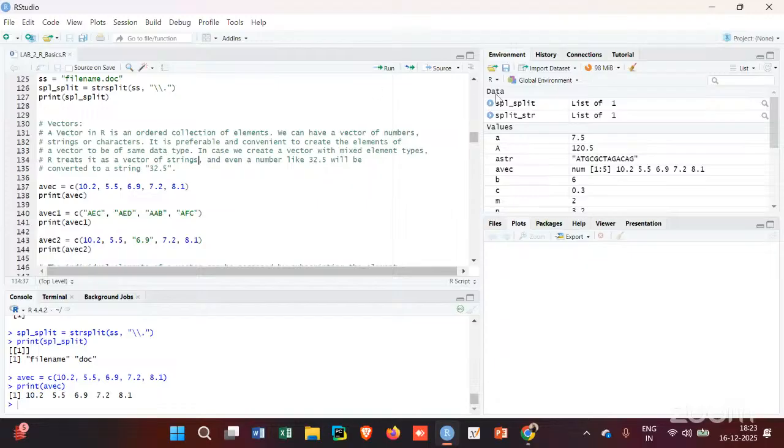And as a matter of fact, I should be able to see here [1], which is nothing but a numerical vector that goes from 1 to 5. There are 5 elements here. That is what this is telling. This is a vector that consists of only numbers. It's a numerical vector.